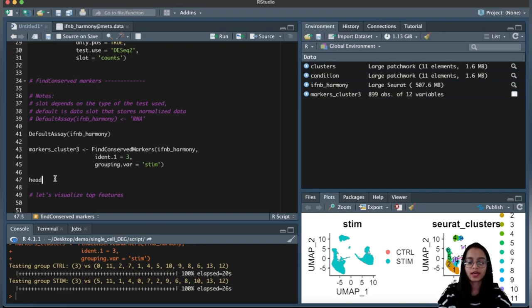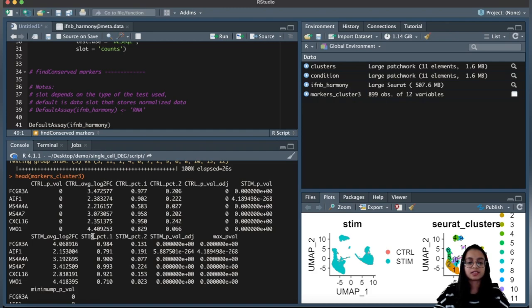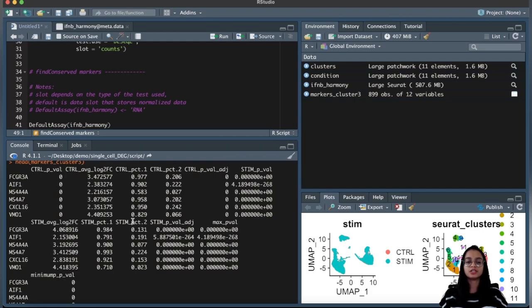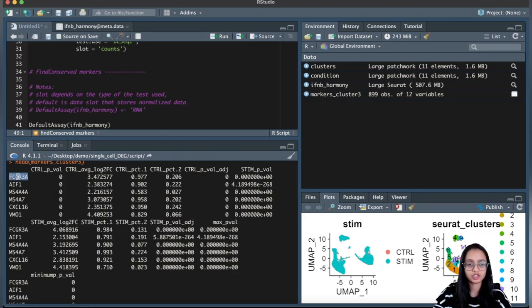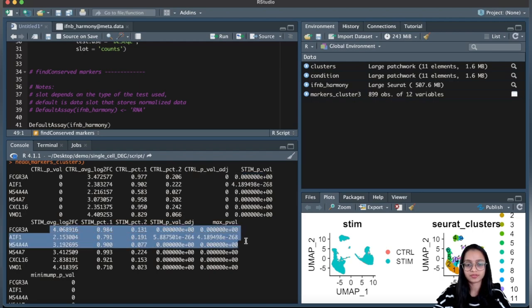Now that it's finished running, let's take a look at our markers for cluster 3. You can see that statistics are calculated for both groups — the control and stimulated. FindConservedMarkers internally separates cells by condition, exactly as described. For each condition, it compared cluster 3 to all other clusters. Looking at the first gene: in the control group, this gene has a p-value of 0 and it's upregulated in cluster 3 compared to all other clusters, detected in 97% of cluster 3 cells versus 20% of all other cells combined, with an adjusted p-value of 0. Similarly, we have the same statistics for the stimulated group.